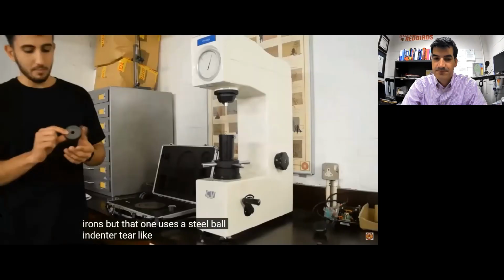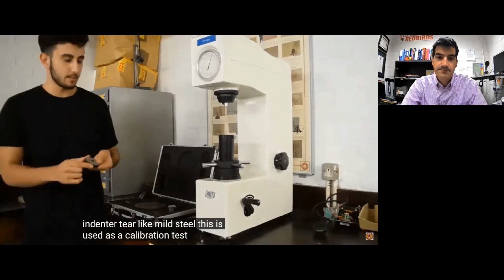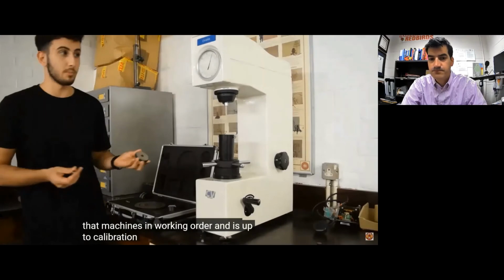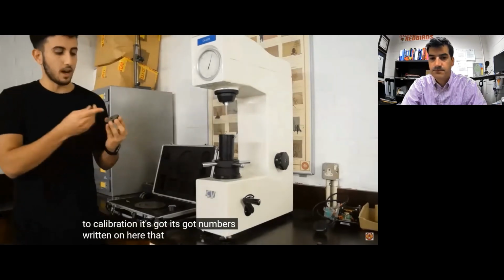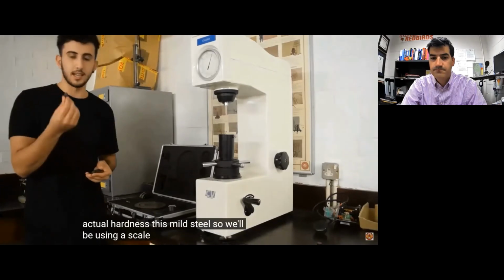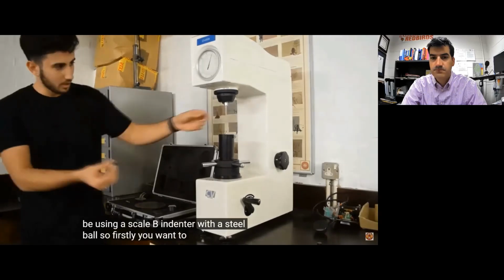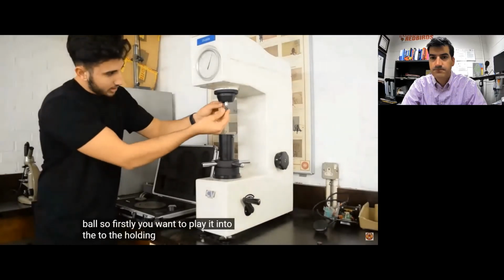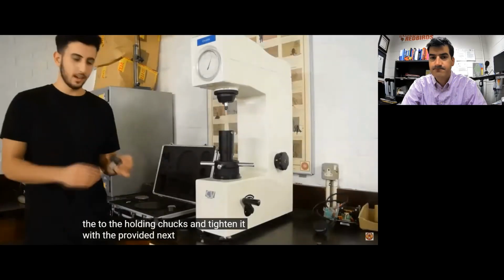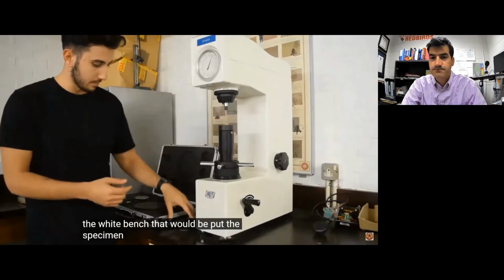Material like mild steel. This is used as a calibration test piece to check that the machine's in working order and is up to calibration. It's got numbers written on here that specify its actual hardness. This is mild steel, so we'll be using a scale B indenter with a steel ball. Firstly, you want to put it into the holding chucks and tighten it with the help provided. Okay, next, we want to put the workbench that we'd be putting the specimen onto.